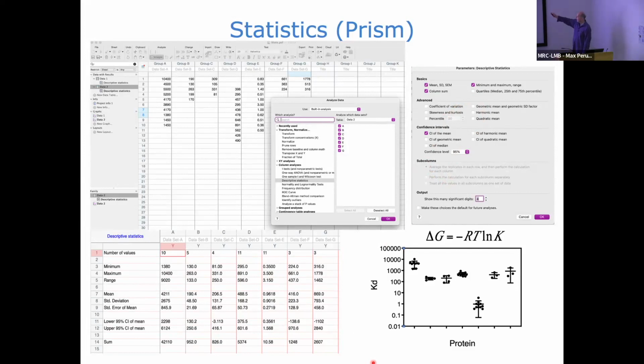In terms of binding constants, we're looking at energy differences. So, in terms of a log view, how significantly different is it if the binding constant is twice or 3 times?